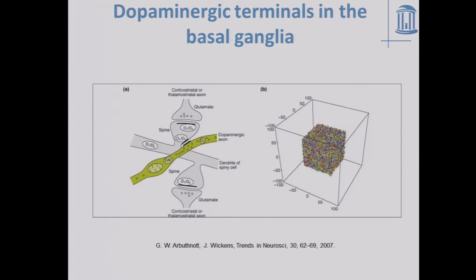Because when we're dealing in the intact behaving animal, we don't have one synapse or synaptic region in isolation. Rather, we're dealing with a number of different substances in this cube that's 50 microns on a side. These different chemical actors are portrayed here by different colors. So there are multiple different substances that are being secreted, that are being used by the neural processes. They're not just neurons, they're glia, they're blood vessels, and so on. And we want to try to understand how this complex matrix is actually working and leading to that endpoint, the behavior of the animal.